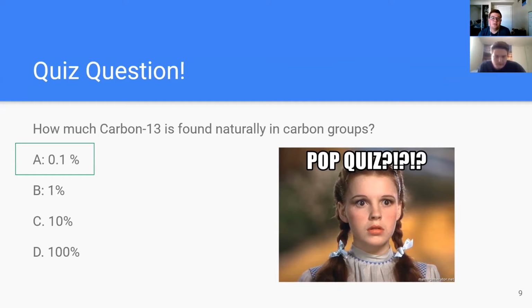But it really is a testament to the modern advances of NMR machines that they're still able to recognize these very minute amounts of carbon-13 enough to characterize these materials effectively. So it's still incredibly powerful.